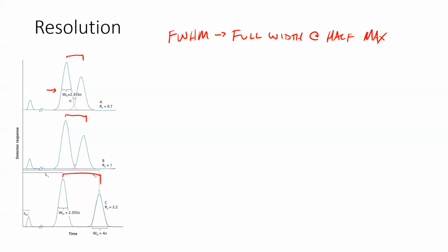And that is one way of looking at it. Another way is looking at the baseline width, right? Because our textbook uses baseline width, that's the one we'll stick with, just so that we're not confusing ourselves.